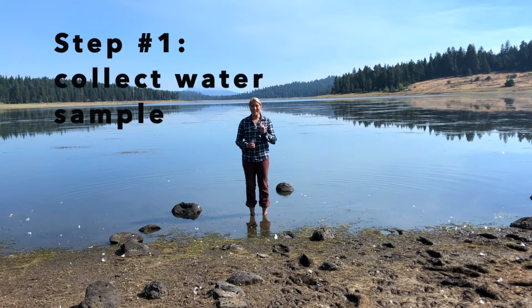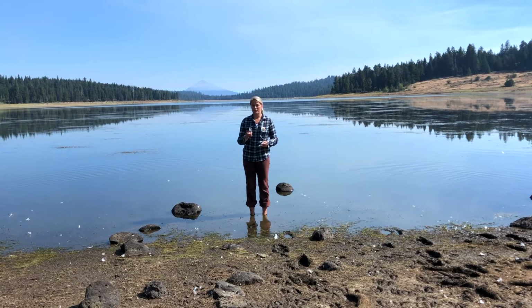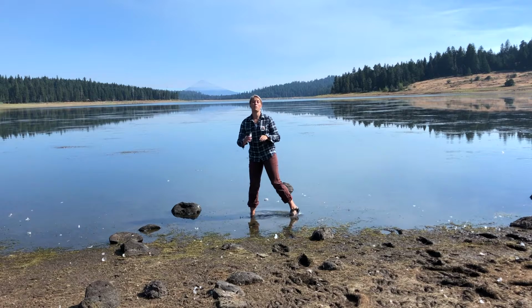So step number 1 is we are going to need to fill this container all the way to the brim with water. It's very important to make sure that it overflows over the top and you get the lid on right away to make sure we do not get any air bubbles in our container. So watch me.